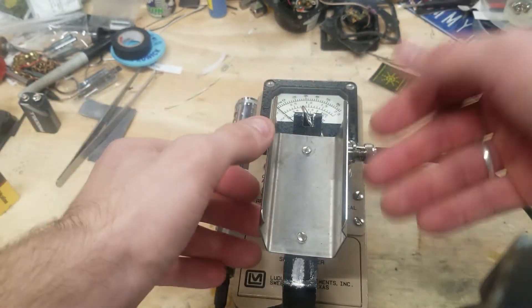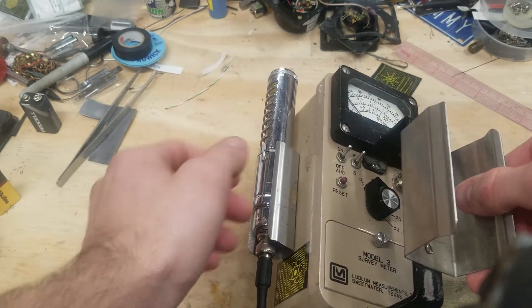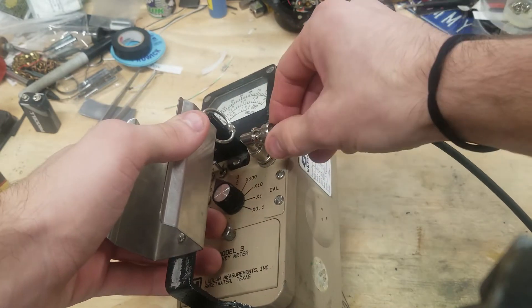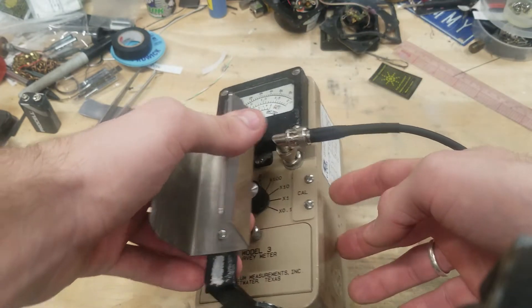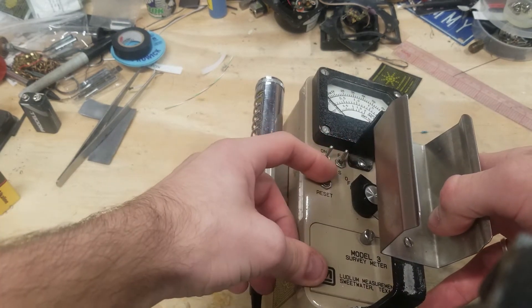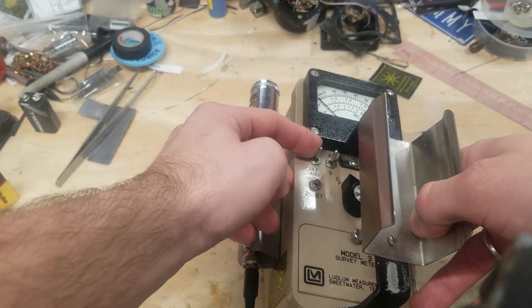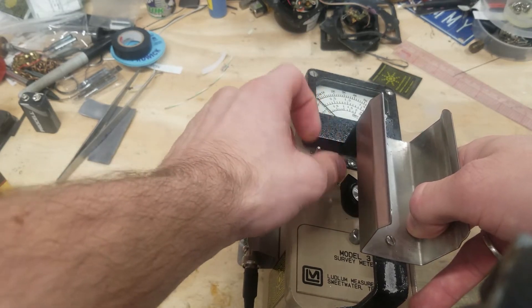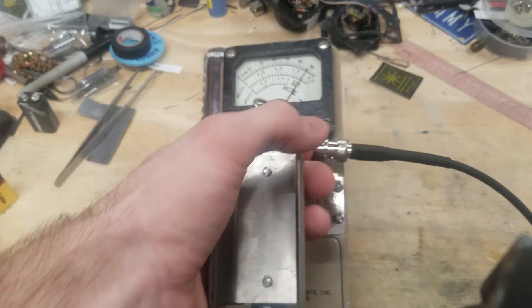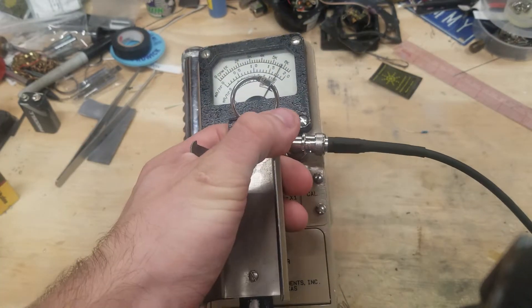In this case, everything is essentially the same as a Model 2. You have an external connector — in this case B and C — an external speaker, your range settings, a reset button, an audio on-off, and a fast and slow. And just like the Model 2, it functions just about the same.